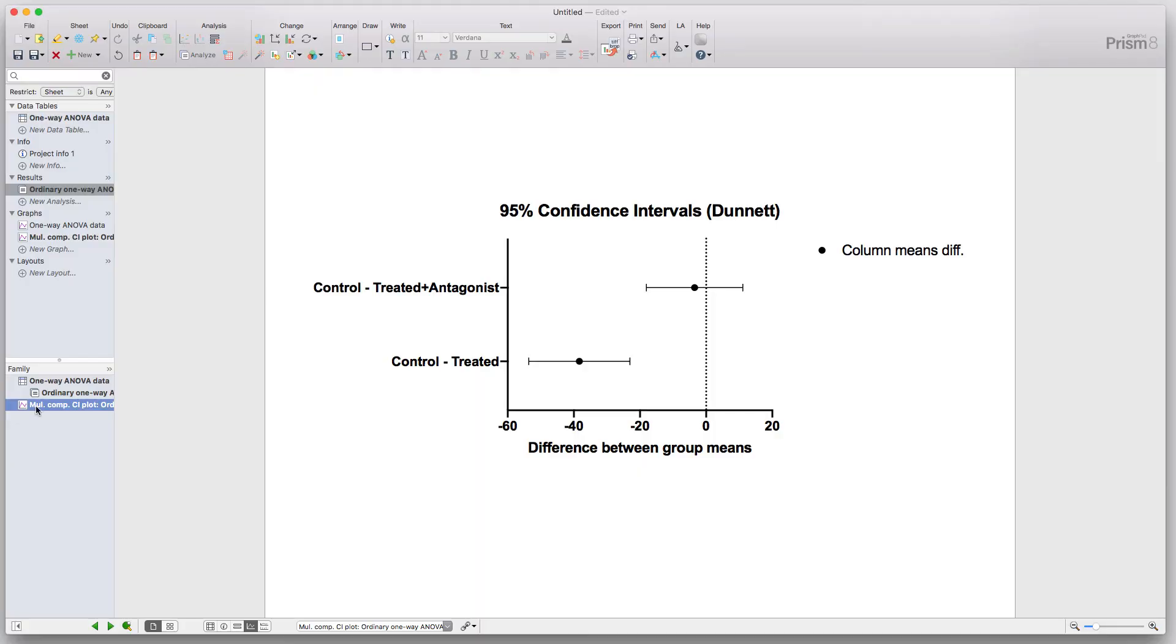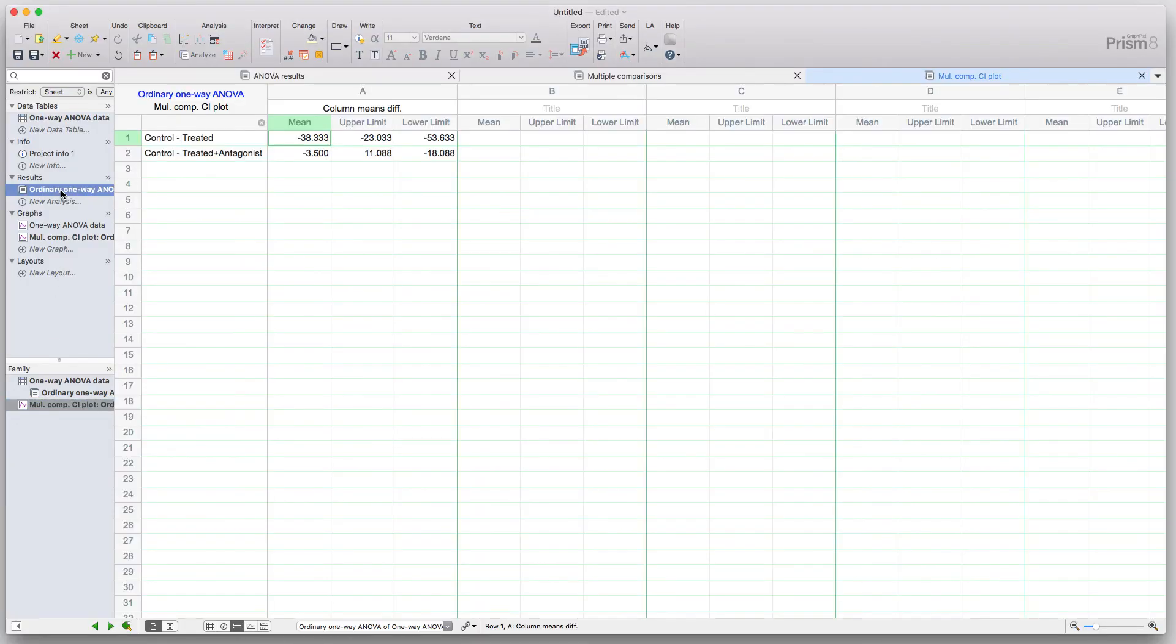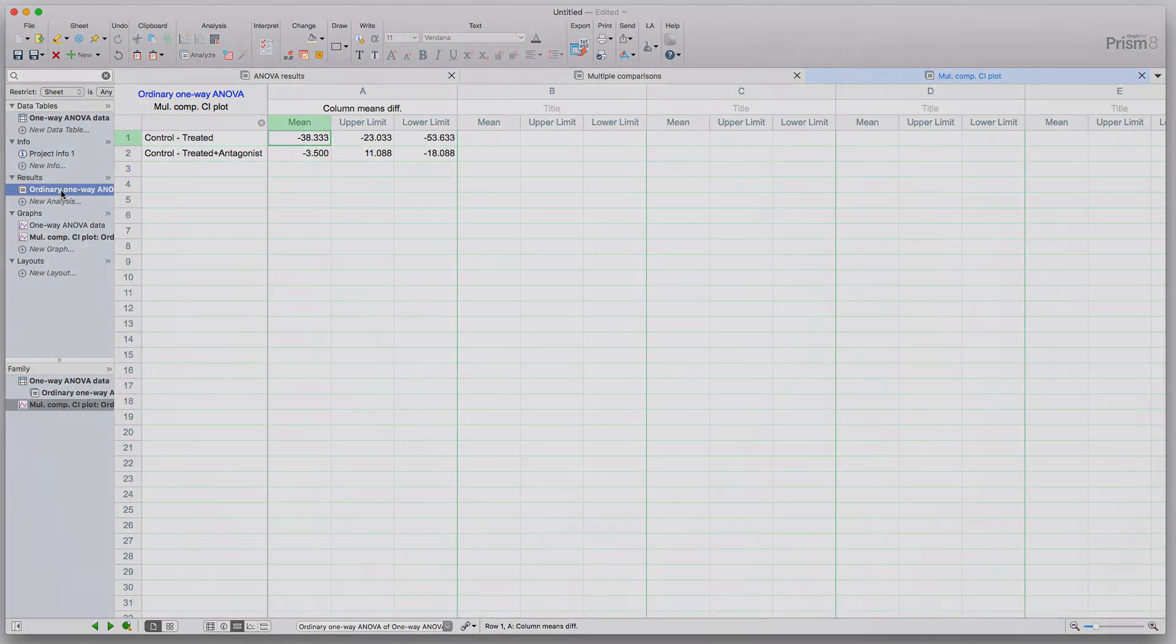So that's just a really quick tip on how to navigate the results and make sure that you can always find the results sheet that you're looking for.